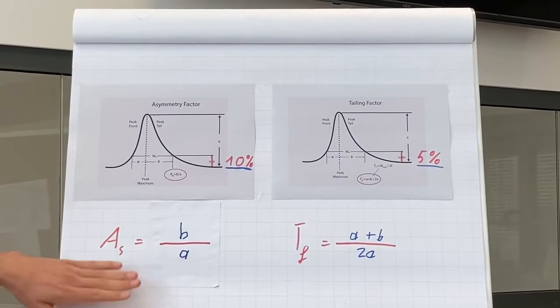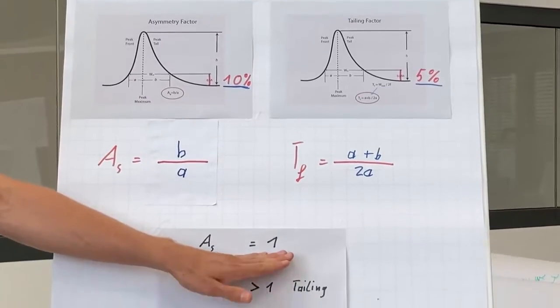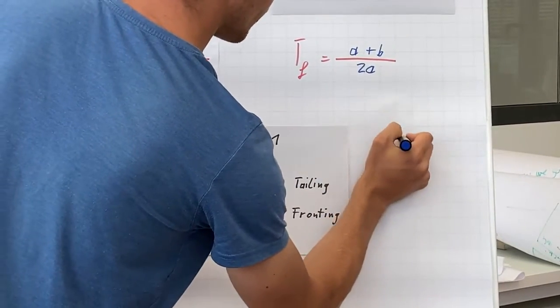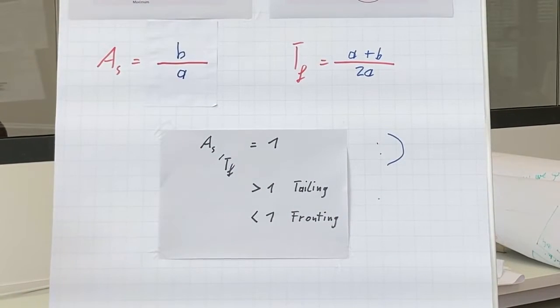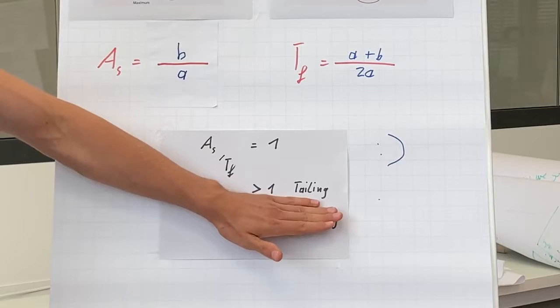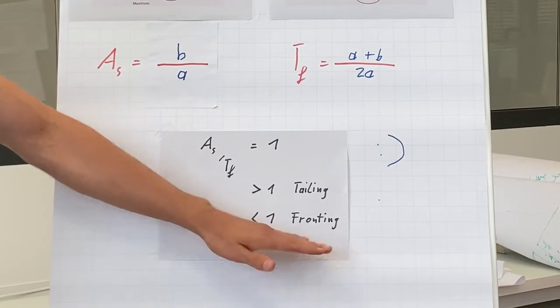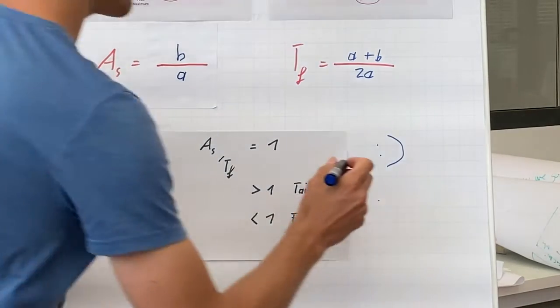If the asymmetry factor or tailing factor takes the value 1, we are happy because we have symmetrical peaks. A value higher than 1 defines peak tailing, whereas a value less than 1 defines peak fronting. In this case, we are not happy because we have non-symmetrical peaks.